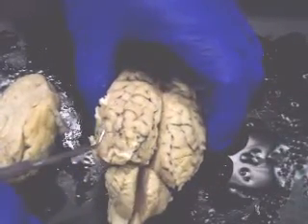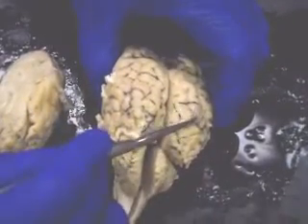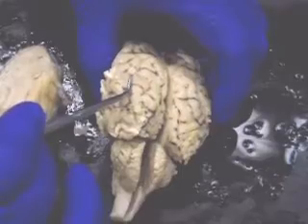So this is looking at the sheep brain dissection for Bio 157. When we look at this, we're looking at the back side of the brain. This is the right hemisphere. This is the left hemisphere.